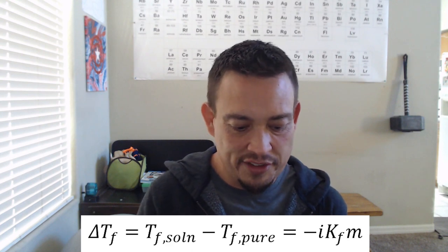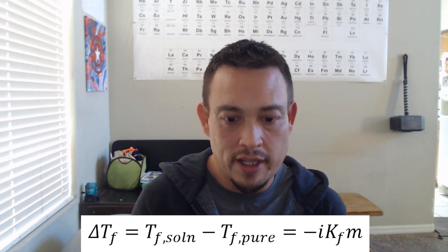So we're going to be running a series of experiments here. First we're going to get the freezing point of pure cyclohexane as the point of comparison. And then we're also going to get the freezing point of two different naphthalene cyclohexane solutions. And then from these values, after we have the freezing point of both the pure solvent and the mixture, you can calculate delta T. And then from there, you can just take your equation down below once again, and then just take your delta T. It looks like we'll just divide by molality here to get our KF value. So I think we know enough now to get started. Make sure that you practice these calculations and let's go ahead and turn it over to Professor Craig Knapp.